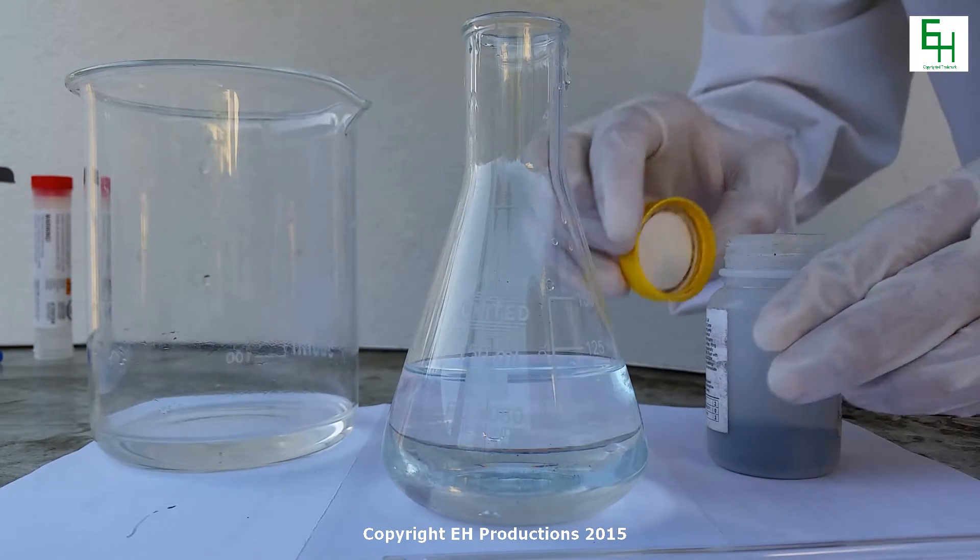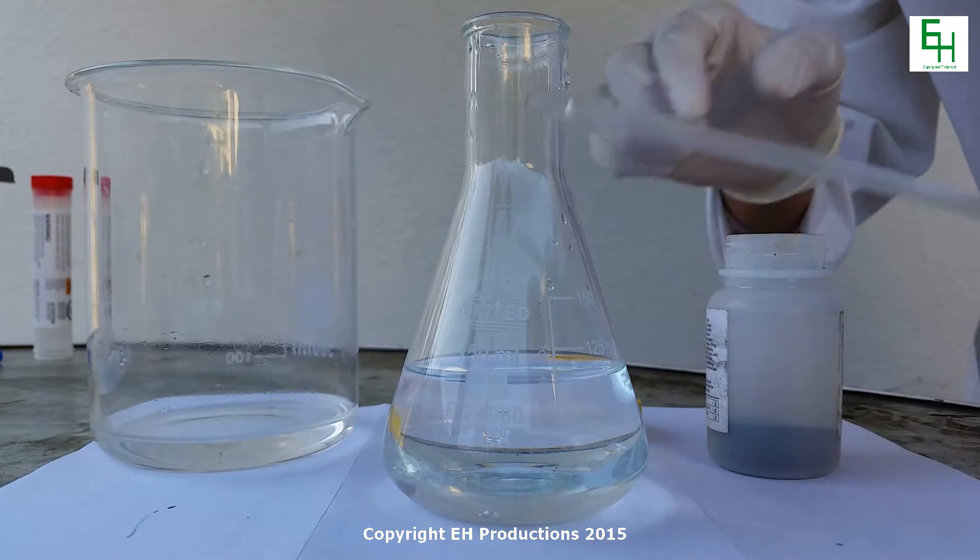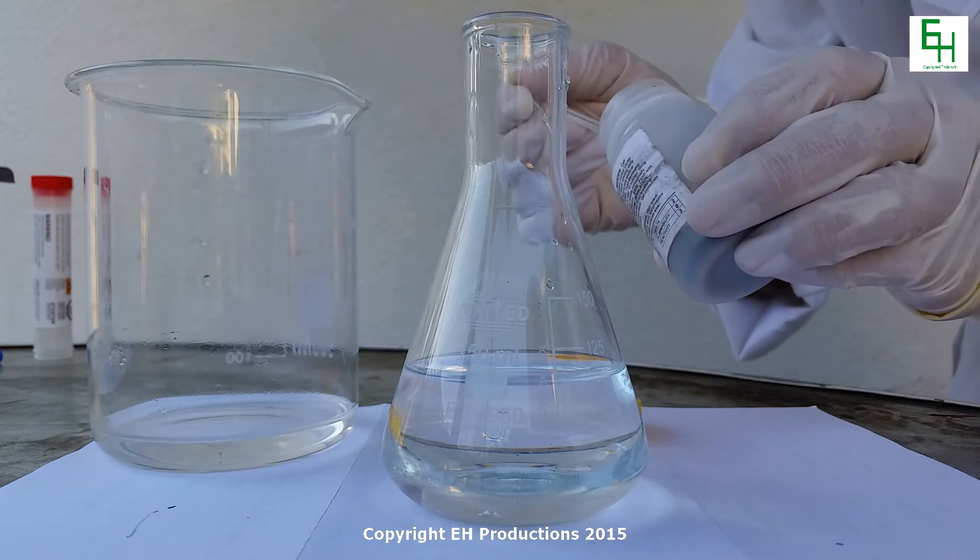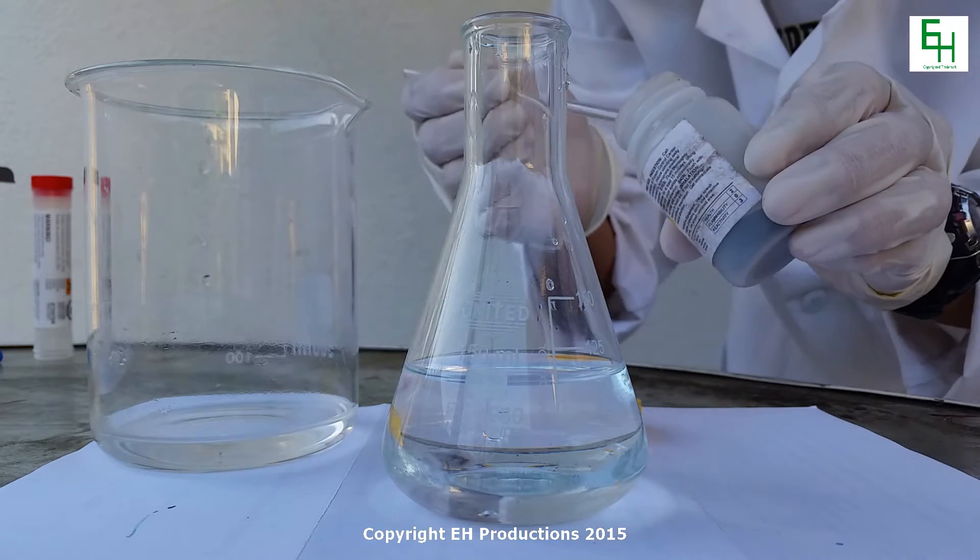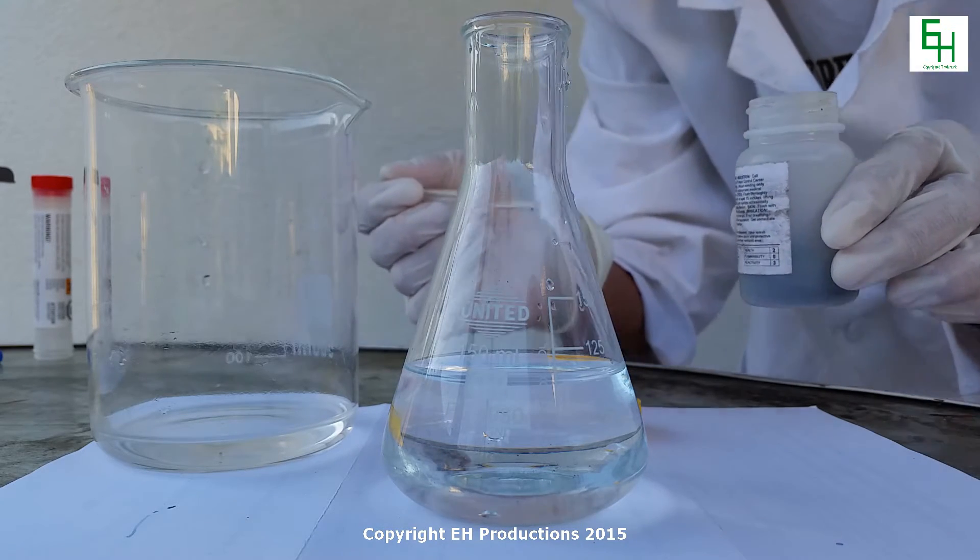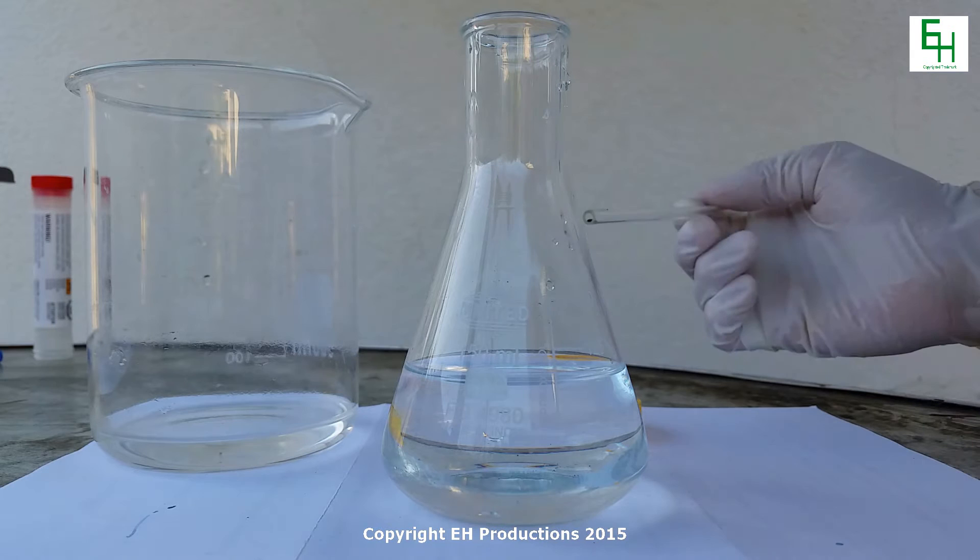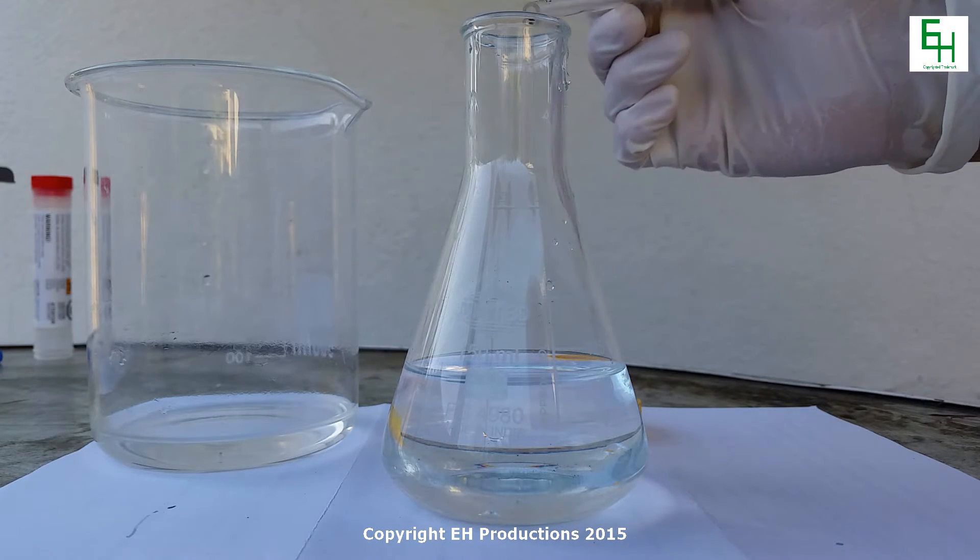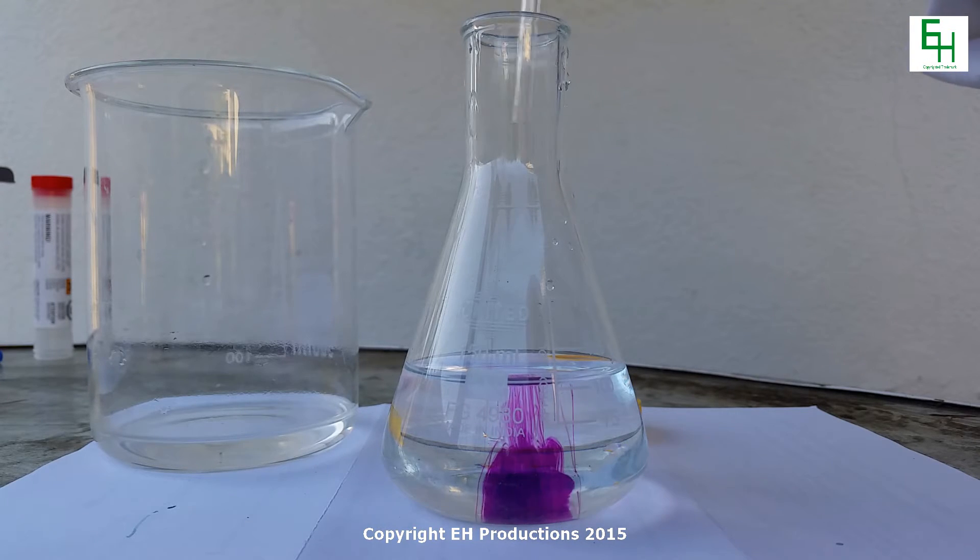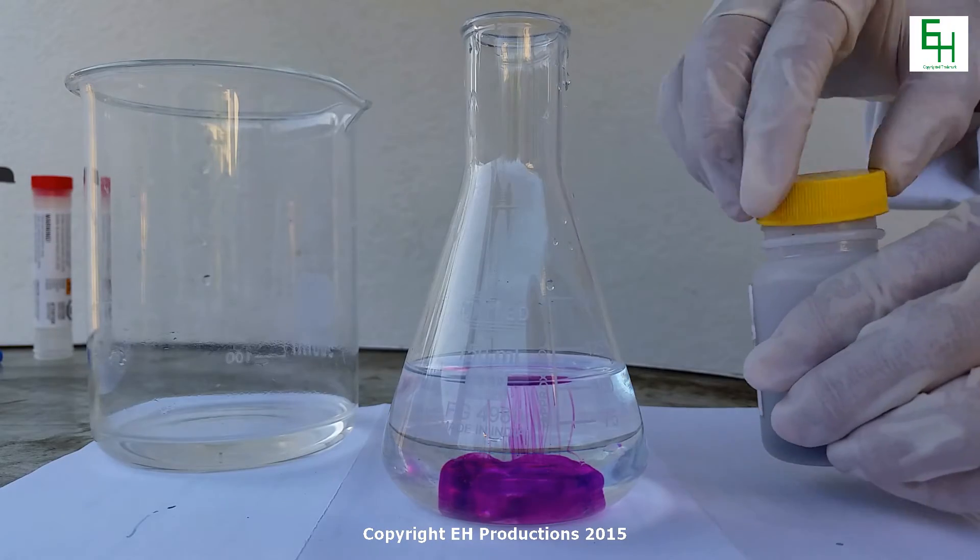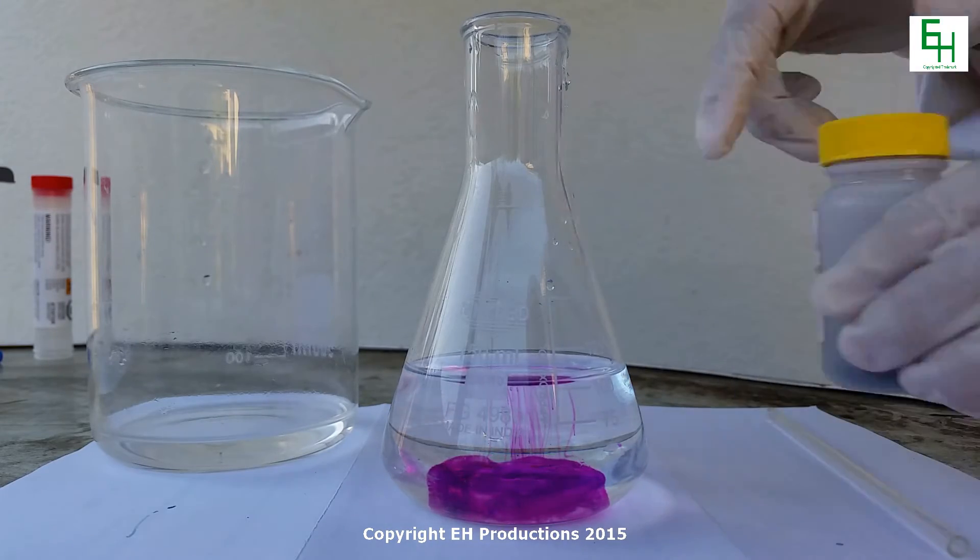I'm going to show you how much potassium permanganate you need. You need just a very, very small amount - like this much is good. You see there's a tiny bit inside, just a tiny bit. We're gonna dump that in. That should be enough. Like I'm saying, it's a super tiny bit.